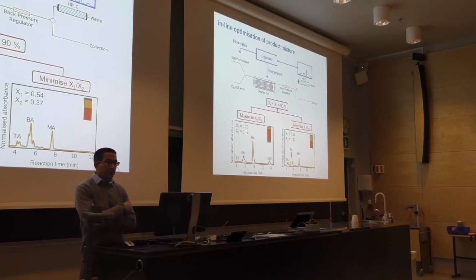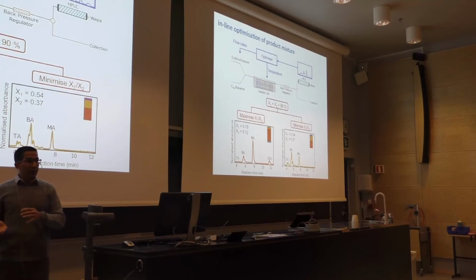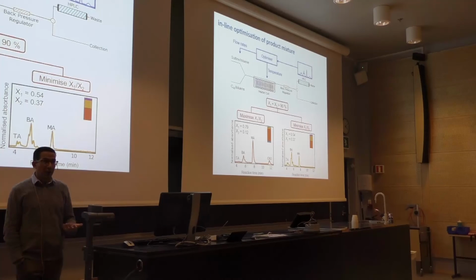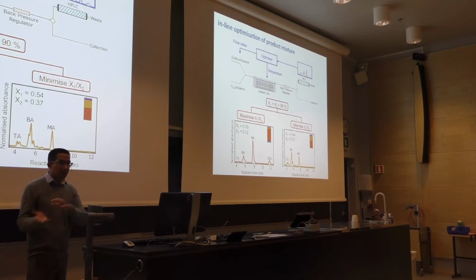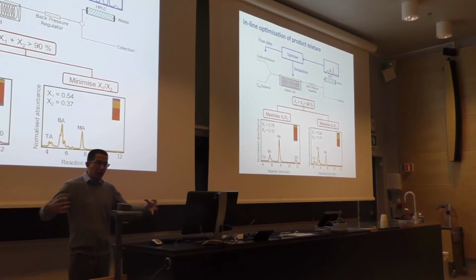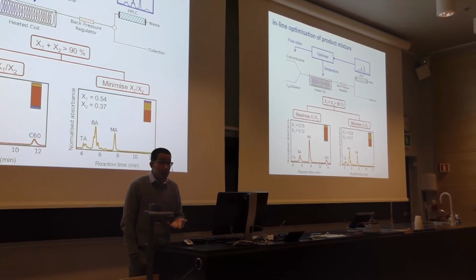For example, you can update reaction compositions quite quickly just by adjusting flow rates, unlike things that are harder to change, like the temperature. If you change the temperature, you have to wait for the system to stabilize. It's got a certain thermal mass. You can't update the temperature more than once every few minutes. So I'm interested in techniques that will allow us to change some things very quickly and other things slower. That will be an incorporation of combinatorial approaches into what I've described here. We haven't done it yet, but we're hoping to.